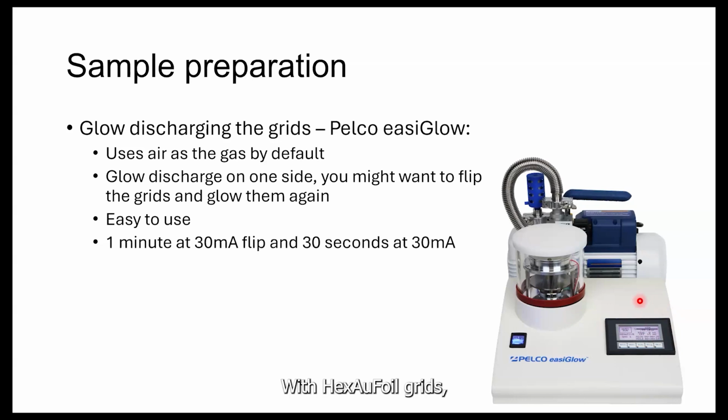For HexAuFoil grids, we do recommend using 1 minute at 30 milliamps, and then flip the grids and do 30 seconds at 30 milliamps again. This will make sure that your grid is properly charged and you don't get blotches of ice on your grid.